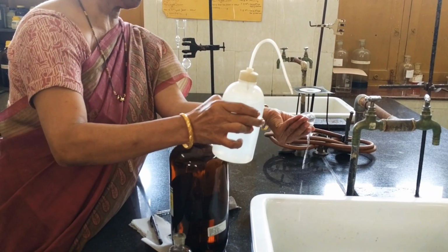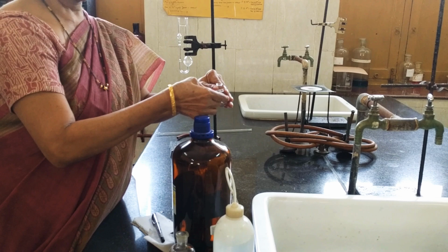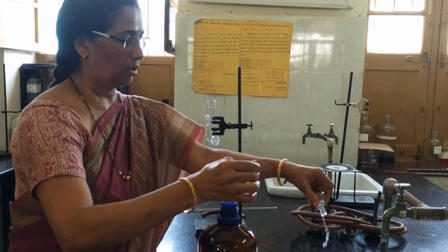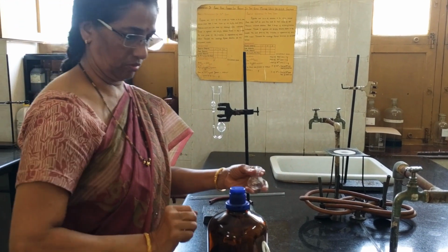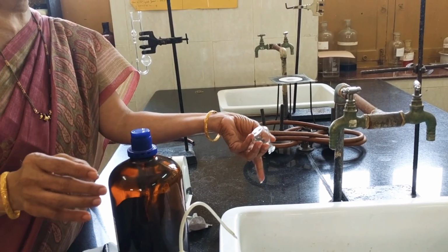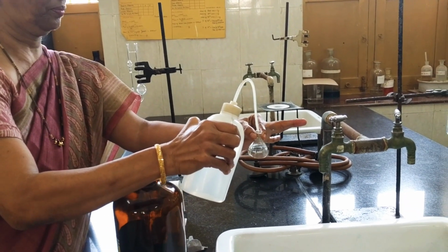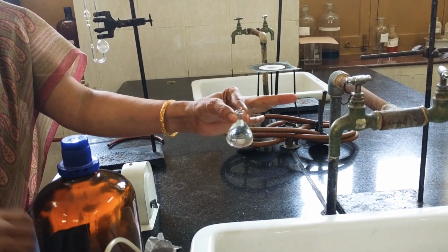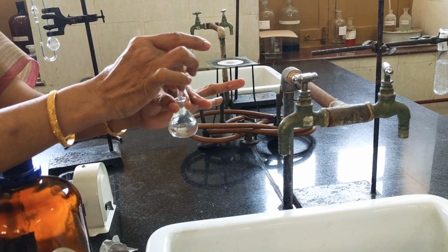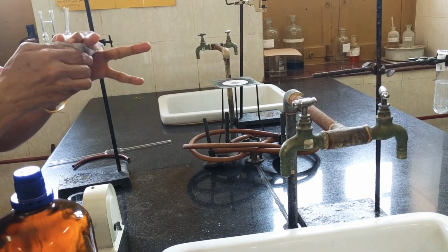Now I have to ensure that I have washed it well with water. Even the nozzle portion needs to be washed well. Throw the water out. Another rinse. Now I shall fill this with water and place the lid as before. The excess water falls. The water is there in this nozzle too. Wipe it clean.